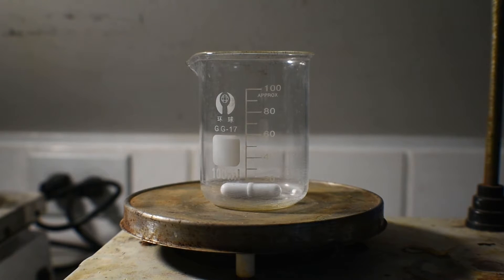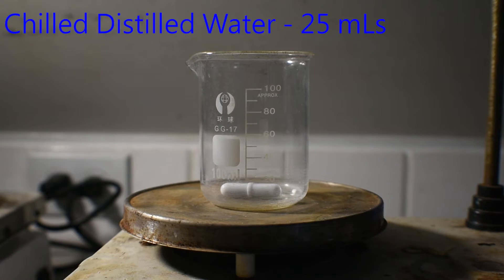While the cobalt chloride is dissolving, I have put, on a separate stir plate, a 100 milliliter beaker complete with stir bar. To the beaker, I'm going to add the 25 milliliters of chilled distilled water.